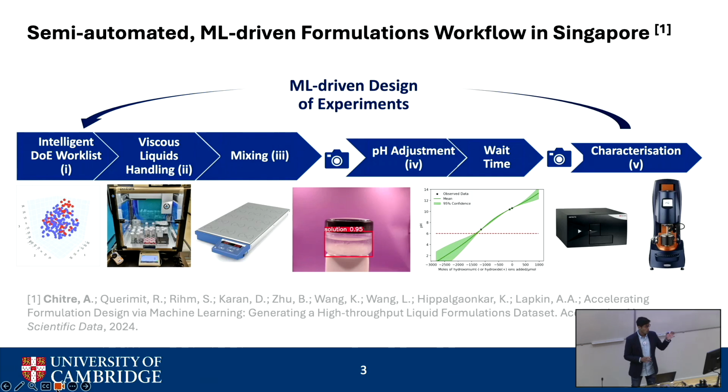On this experimental workflow, we ran an 8-month experimental campaign and generated over 800 liquid formulations. And this data set and workflow has recently been accepted to Scientific Data, so hopefully this, along with all the ingredient structures, will be published soon.